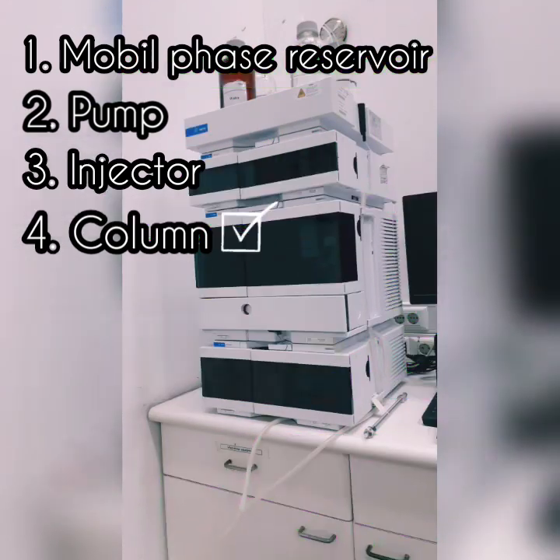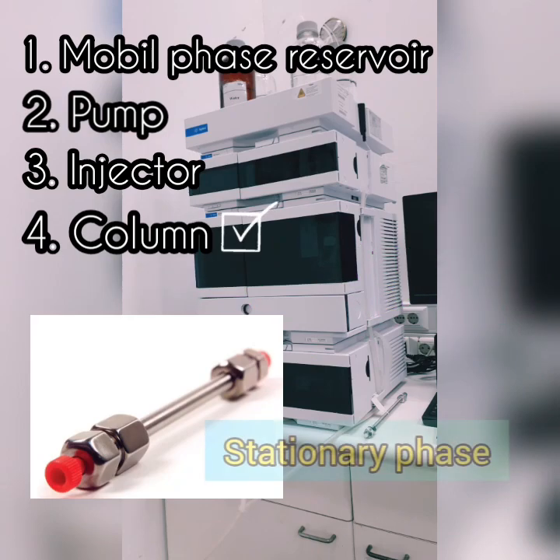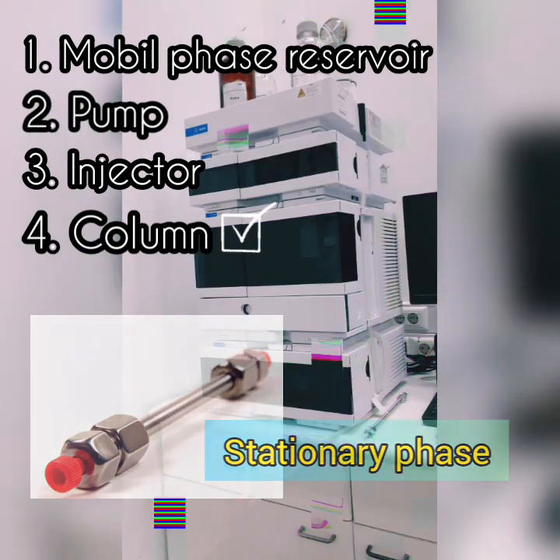Column. Columns are usually made of polished stainless steel, between 50 and 300 millimeter long and have an internal diameter of between 2 and 5 millimeter. They are commonly filled with stationary phase with a particle size of 3 to 10 micrometer. Columns with internal diameter of less than 2 mm are often referred to as microbore columns. Ideally, the temperature of the mobile phase and the column should be kept constant during an analysis.